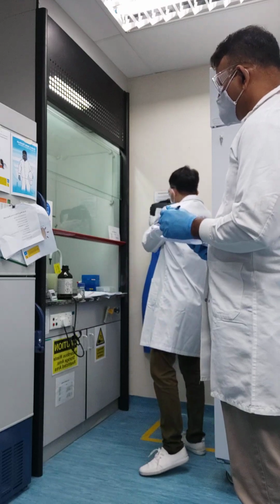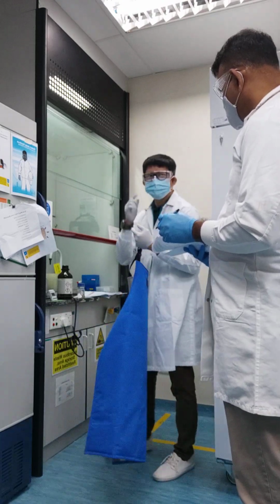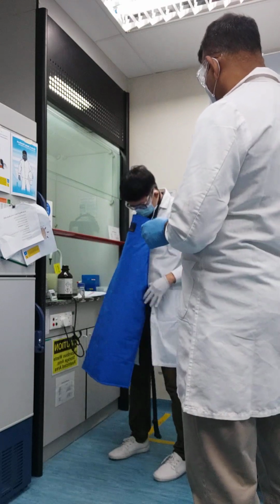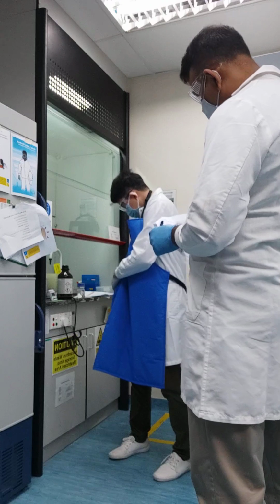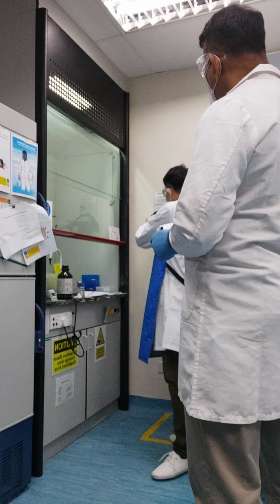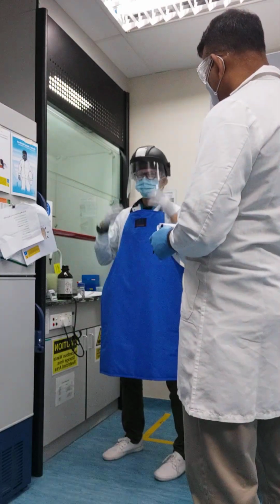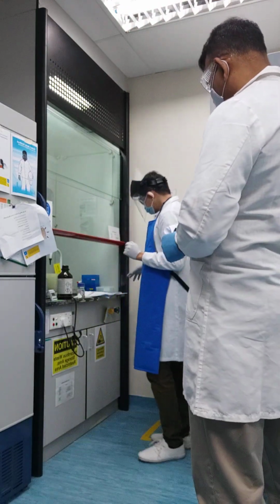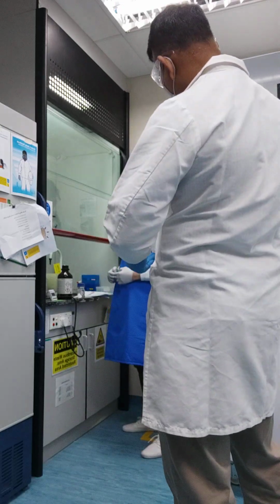Mr. Chandra told me that I need to put on an apron. First, I already have my mask. Then I put on the apron. Secure. And my gloves. Next I wear my face shield to protect myself, my body, and my nose. Alright, I'm ready to start my experiment. Mr. Chandra, can I start? Yes, please go ahead.